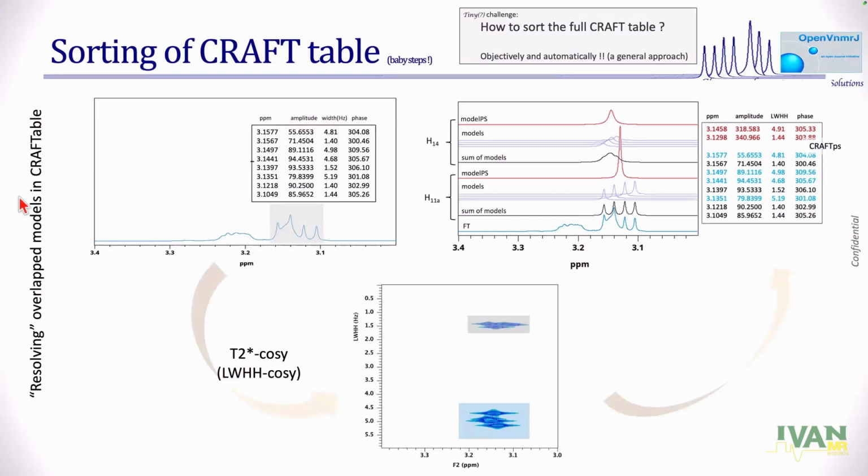So we said, okay, let's take a plot. There are 2 parameters here that are kinetic. One is the rate of change of phase, another one is the rate of change of amplitude. 2 kinetics.